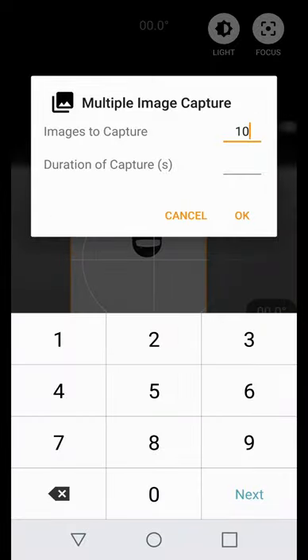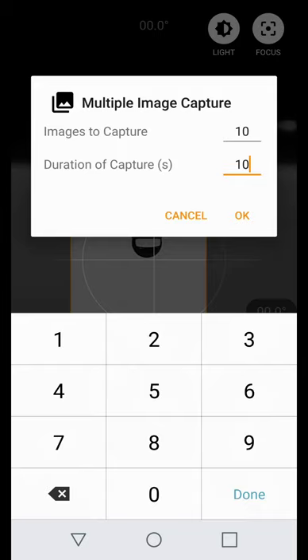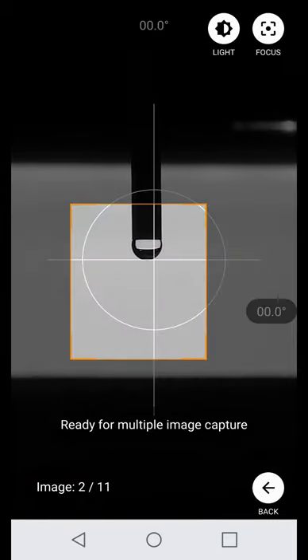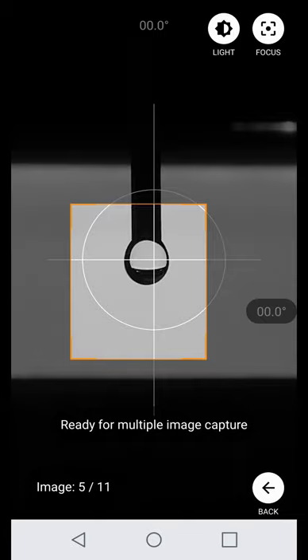Simply specify the number of images to be captured, and the duration of the capture. Once everything is ready, hit the capture button and start generating the droplet.